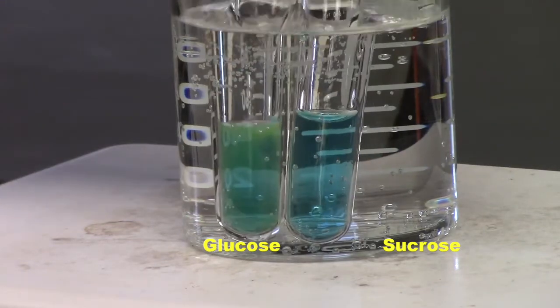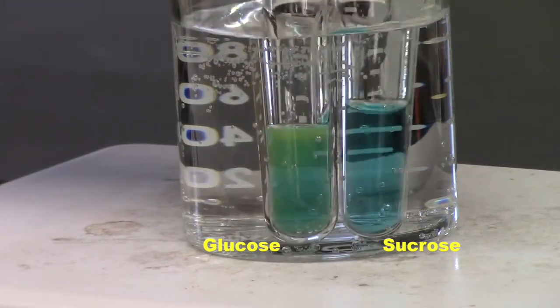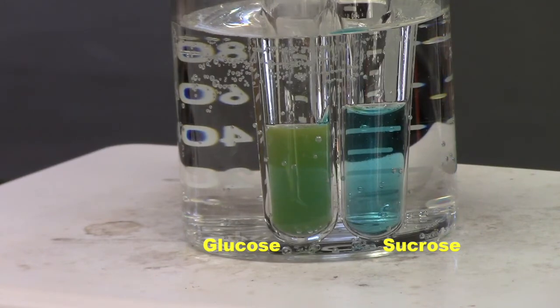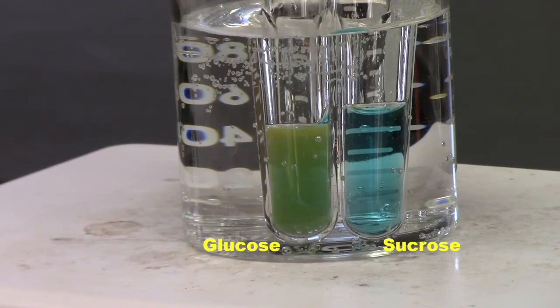This one here is glucose. This one here is sucrose. All right. So now we just sit and we wait for something to happen. And I think if you look, you can already see something is definitely happening with the glucose. It's starting to change color. Let's give it a little more time, a little more energy in the heater, see what happens. But you can already see definitely something is occurring with the glucose solution, not the sucrose solution though, so that's interesting. We're going to let that go for a few more minutes.